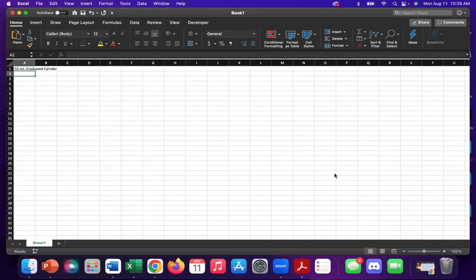In this video, I'm going to demonstrate how you're going to enter your data into Excel in order to determine the average volume of water measured by a particular device and its standard deviation. The first thing we're going to do is identify exactly what device we use to measure the water. So for example, let's say we used the 50 ml graduated cylinder to measure out 25 milliliters of water.